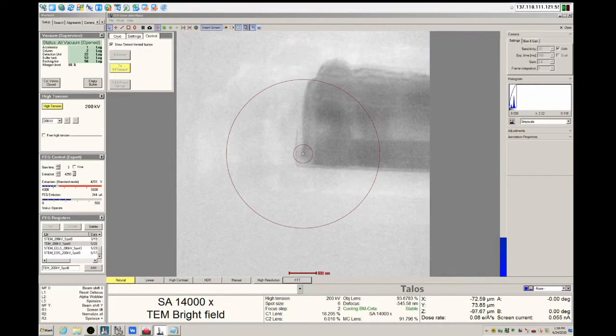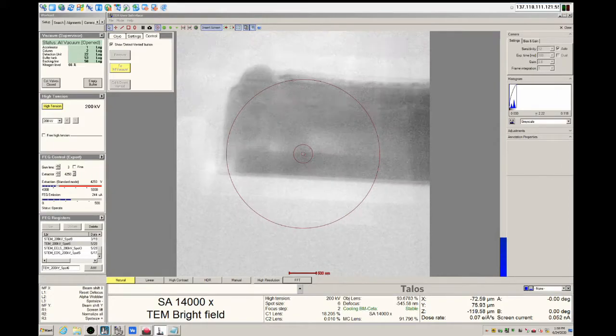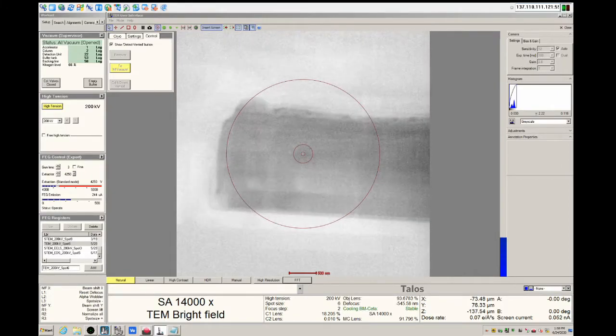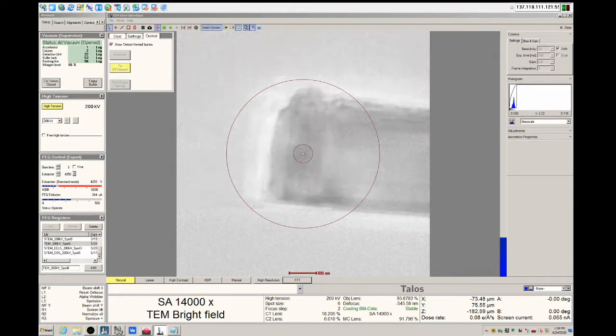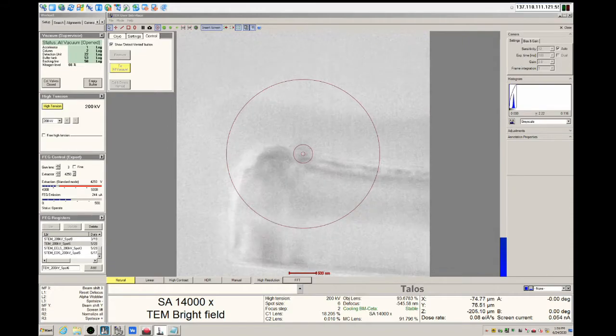The sample will be roughly at the eucentric height whenever there is minimal contrast between the sample and the vacuum background. In other words, the sample will look very pale and transparent, as shown here.